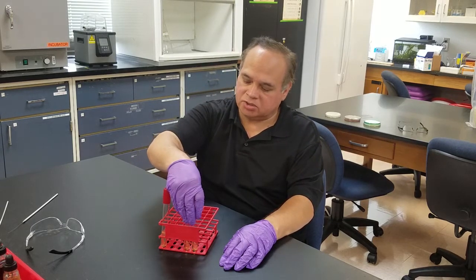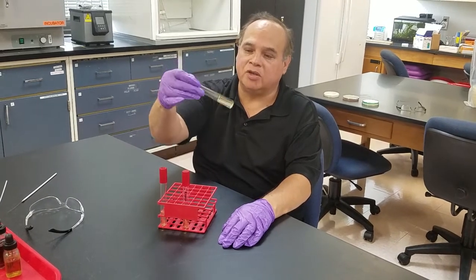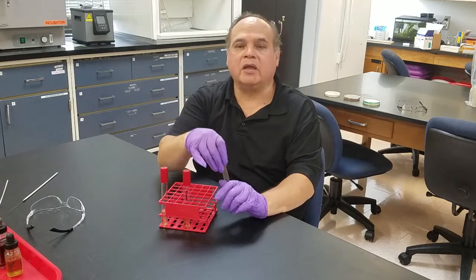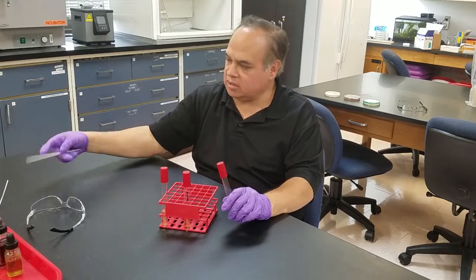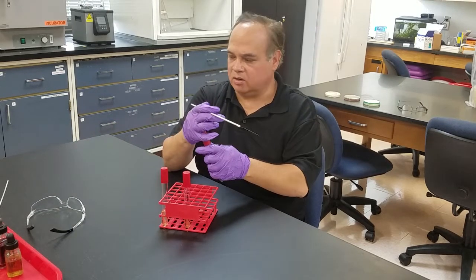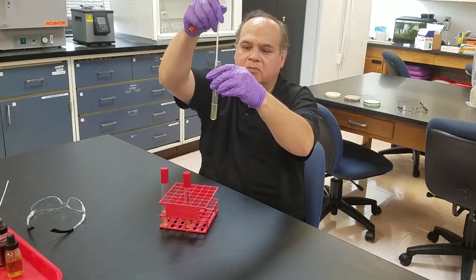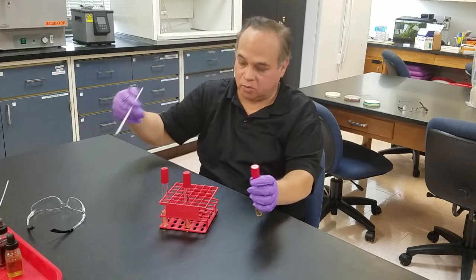This is a semi-solid, and so if we take a tube that hasn't been inoculated, you can see it's kind of like jello. We would inoculate with any tool — there's no organism in here — you could use a loop or needle and just take it and inoculate it into the medium. It can be real messy; it's not like a motility medium, so be really careful.